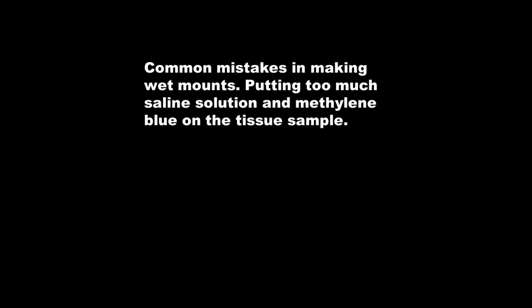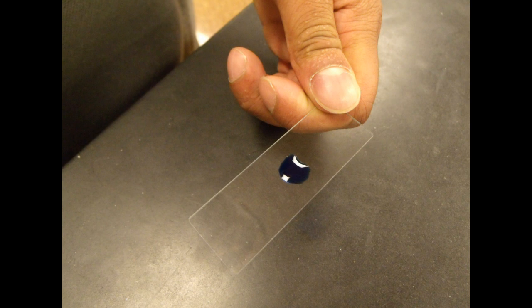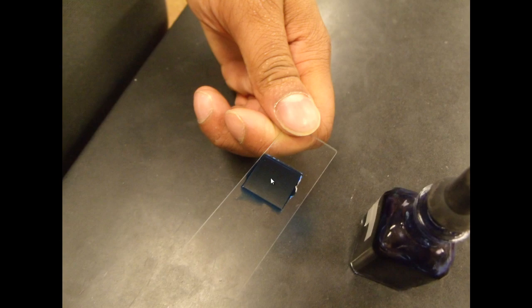Common mistakes in making these wet mounts is putting too much saline solution and methylene blue on the tissue sample. This would be an example of way too much saline solution and methylene blue and it would cause this cover slip to be floating around so that you won't be able to get a good sample and get a good look at the tissue.